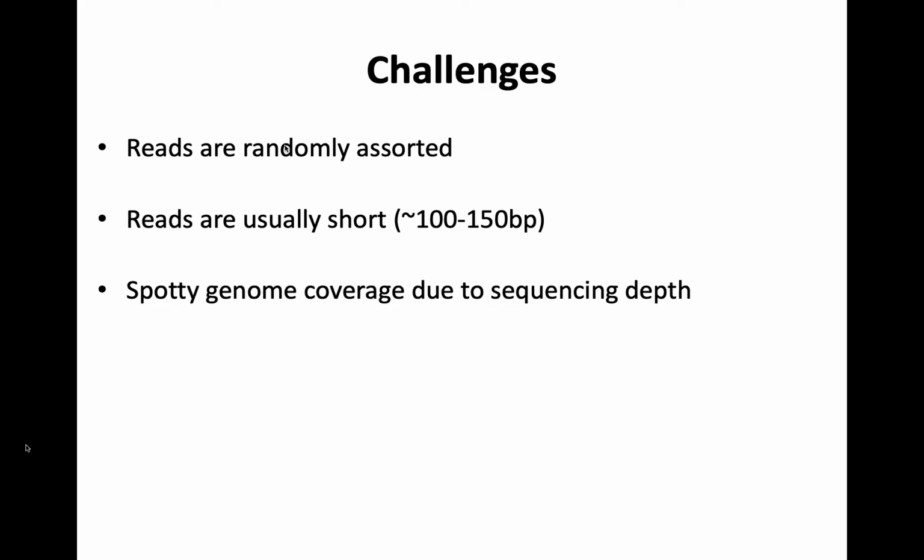And we're sequencing at a depth, say if we're talking about this 10 million reads, that in, say, a human microbiome, definitely there's hundreds of different organisms. We're not going to get full coverage of the vast majority of these organisms, right? So even for the most dominant one, we still might have spotty coverage on its genome. For the things that are more rare, we're going to maybe get a few reads, 10 reads, 20 reads to some of these organisms, right? So we're not going to have its full genome. And so that makes assigning taxonomy to just a few reads much harder than, say, a whole genome.